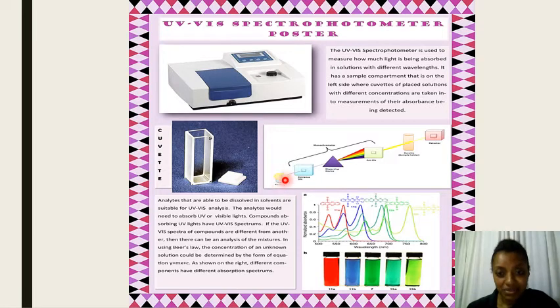The light goes through the entrance slit. The entrance slit, the dispersing device and the exit slit, these three are the components of the monochromator. The monochromator basically helps to disperse light and also to select a single wavelength.